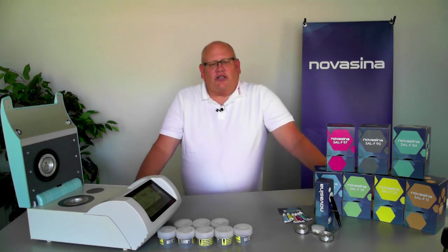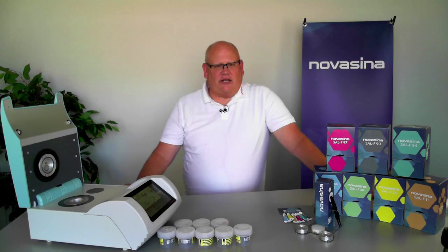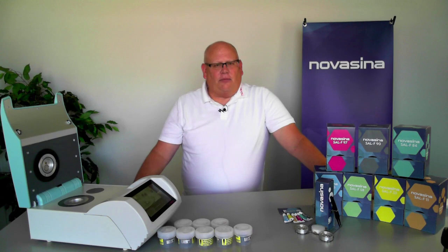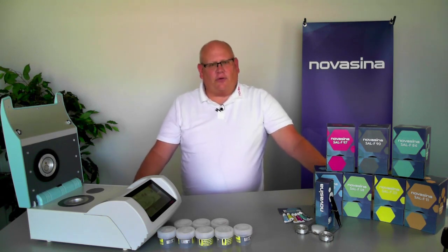We have great standards that can be used for water activity instruments. These are independent standards of known water activity, so you can put them in the instrument, take a reading, and see whether or not the instrument is reading correctly based upon how close it is to the reported value for the standard.